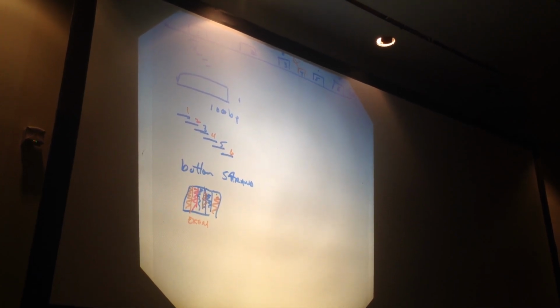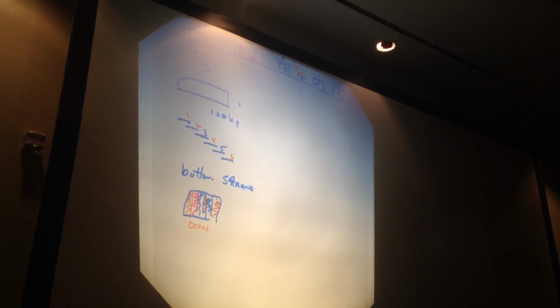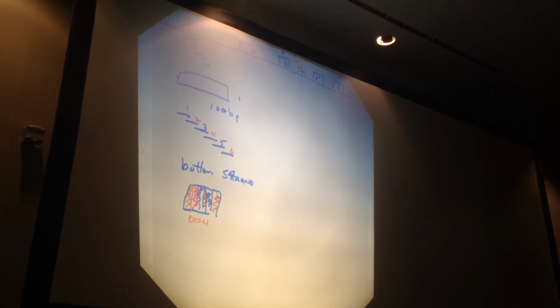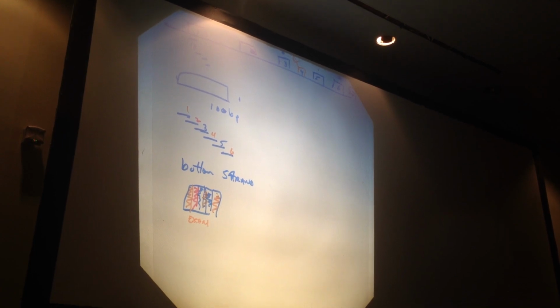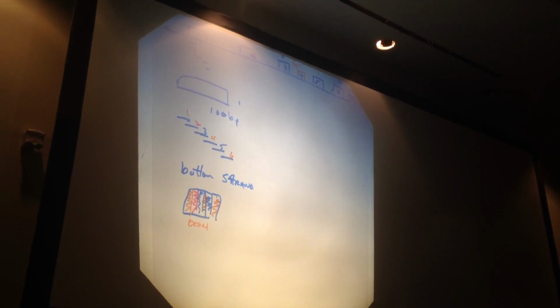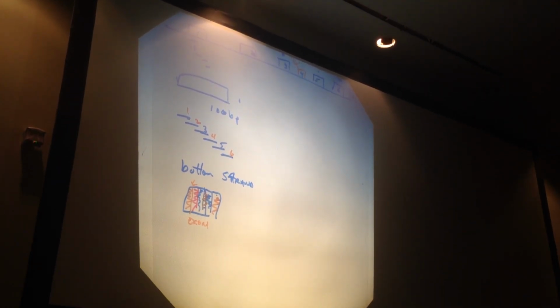In their mechanism, by the way, when an RNA binds to the chip, they are not revealing fluorescence, but a change in resistance. So they have the chips under electrical charge with current going through the chips. And when an RNA binds to an oligo, the electrical current in this little place here changes. And they can measure how much resistance it changes.